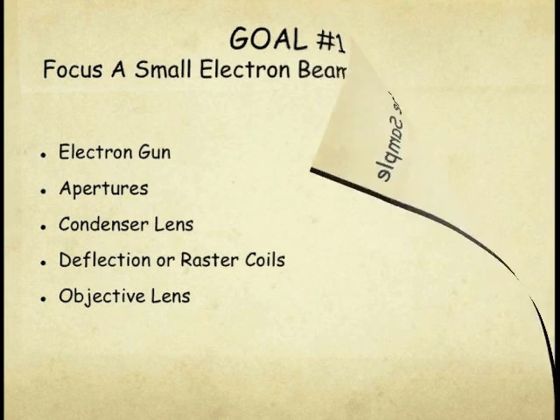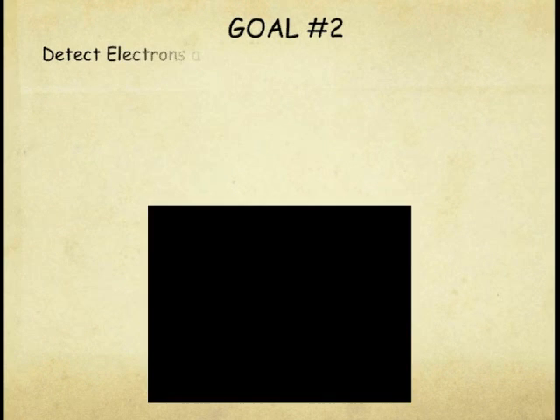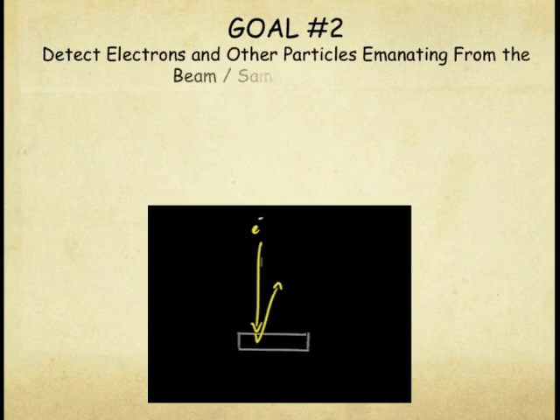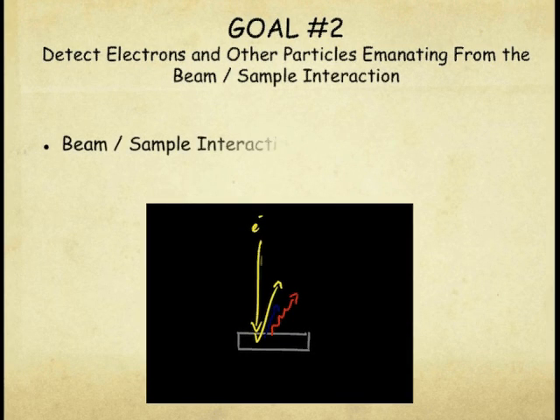Now let's turn to our second goal: detecting electrons and other particles emanating from the beam-sample interaction. Let's begin with the discussion of beam-sample interactions.